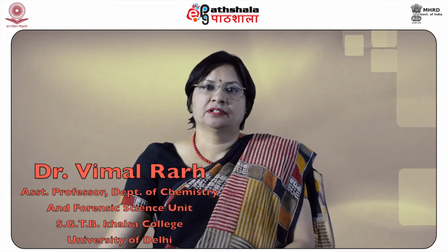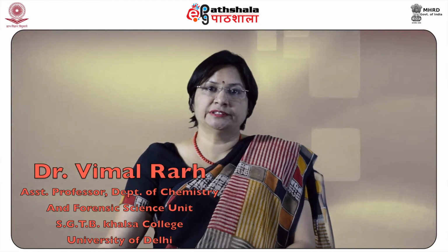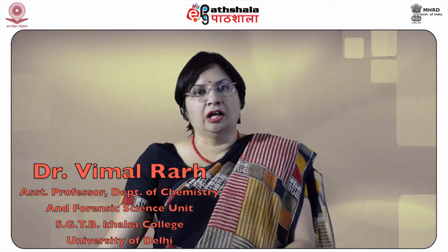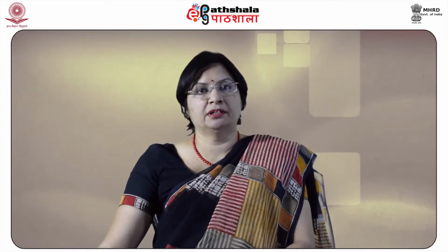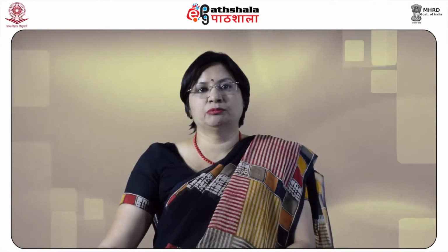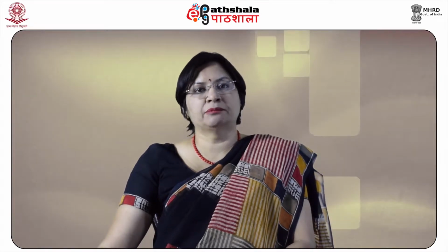Dear students, let us continue our study of this paper, which is Forensic Chemistry and Explosive. And in the Forensic Chemistry section, now we shall proceed towards the chromatographic methods of chemical analysis. After studying this module, you shall be able to know about the basic principle of chromatography.